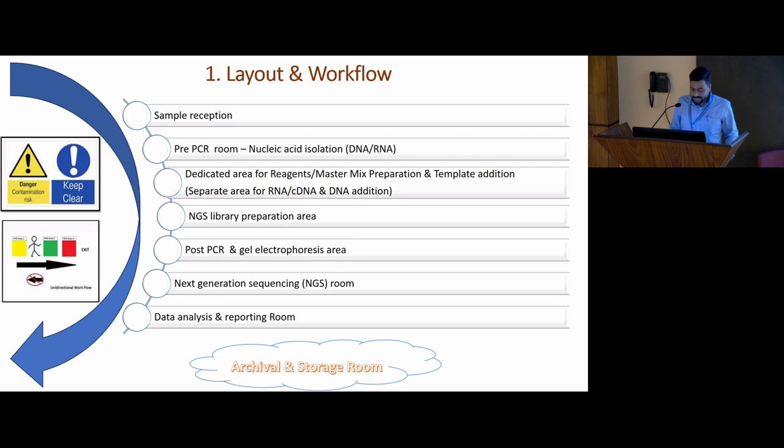Now next is the data analysis and reporting room. The data analysis area is used for performing bioinformatics, with various software and high-end servers. This is a special area required, and it is very important for the large data sets generated by next generation sequencing.